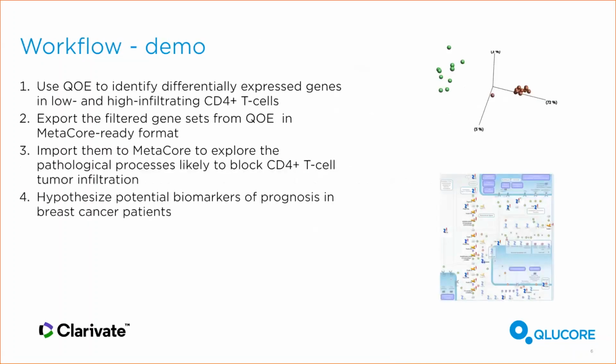Okay. So the next slide shows what we'll be demonstrating today. We're using a data set that's publicly available, a large set of data of differentially expressed genes that Anne will then upload into the Omics Explorer and demonstrate identifying signals in that large data set. And we'll be focusing on those that have a low infiltration of T cells and those that have high infiltration of T cells, and looking at the differences there.